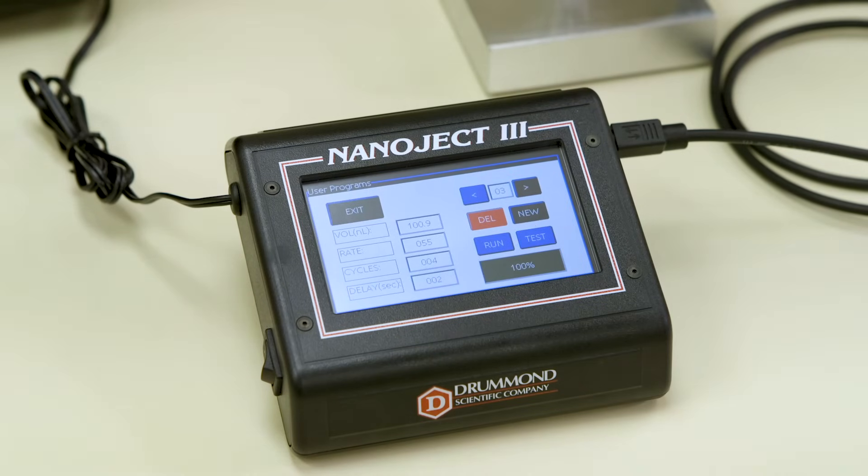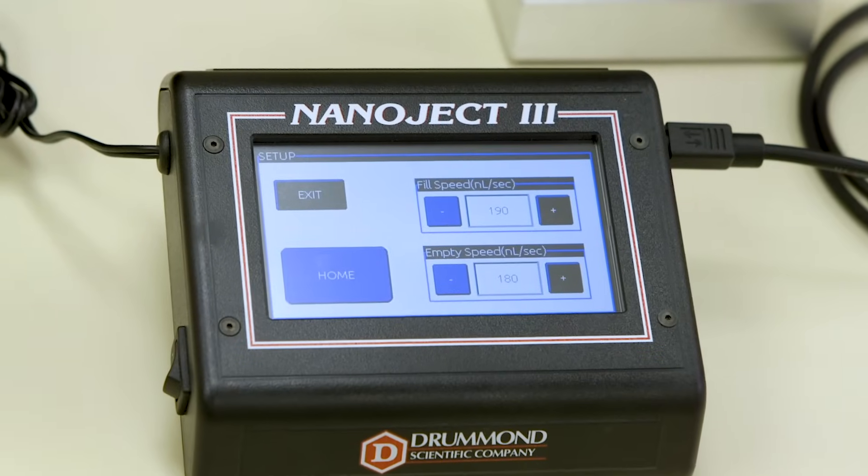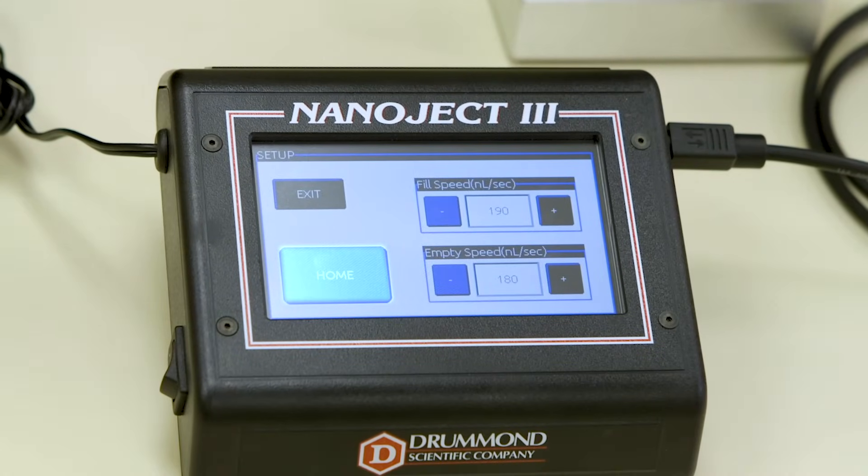If necessary, you can pause injections by pressing Pause. Next is the Setup mode. Here is where you can choose your fill and empty rates, as well as another Home button.